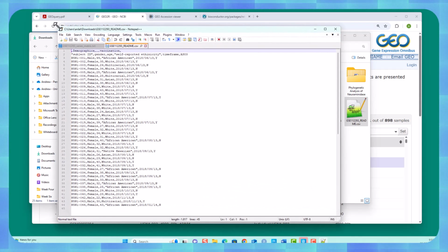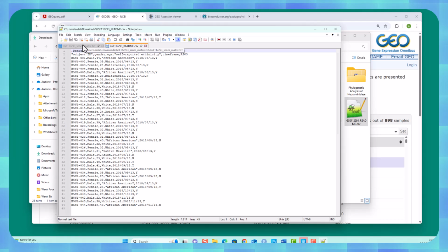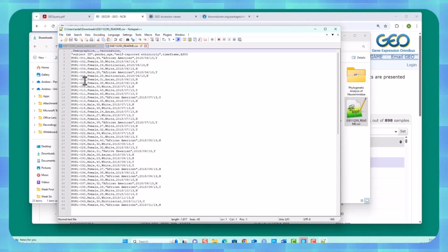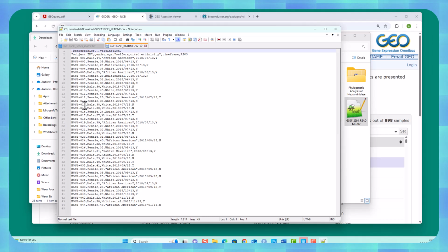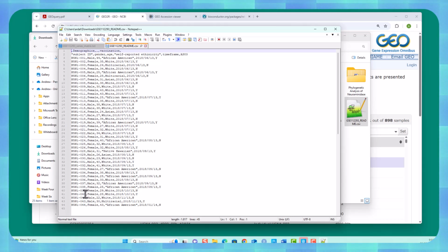We have a file which has 44 numbered subjects, but if you look, you've got 1, 2, 3, up to 26, 27 is missing, 28, 29, up to 40, 41's missing, 42, 43, 44. I think that's just 2 numbers missing out of the set.